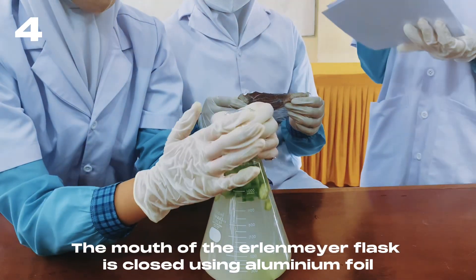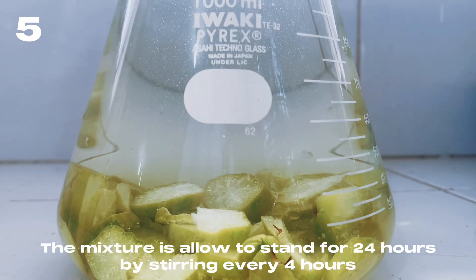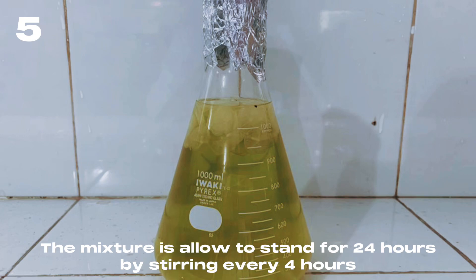The mouth of the Erlenmeyer flask is closed using aluminum foil. The mixture is allowed to stand for 24 hours, with stirring every 4 hours.